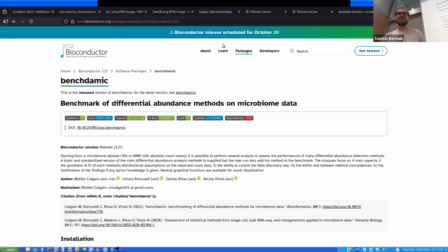Okay. For functional data, for example, data from HUMAnN or functional stuff, can you integrate directly in the object, or do you need to use, for example, two different objects, one for the functional? Yes, so you can add it, for instance, to the alternative experiment slot if you have one-to-one mapping, and you usually have that when you are using the HUMAnN pipeline, for instance, you get the functional annotations and the taxonomic annotations.